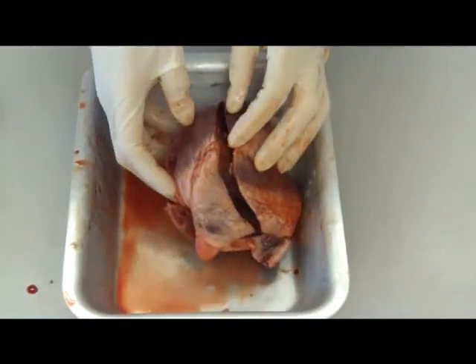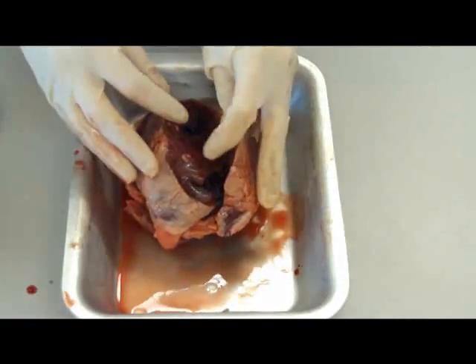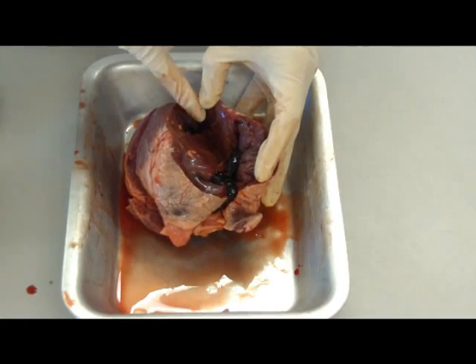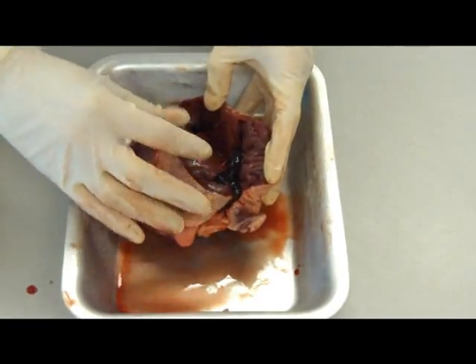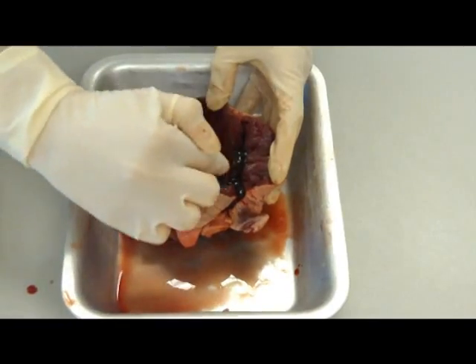If we actually turn the heart over on this side, which you can see is much bigger, is the left atrium at the top and you've got the left ventricle at the bottom. Those are your two chambers and they are divided up using a valve to stop backflow of blood. You can actually see some of the blood still in here.